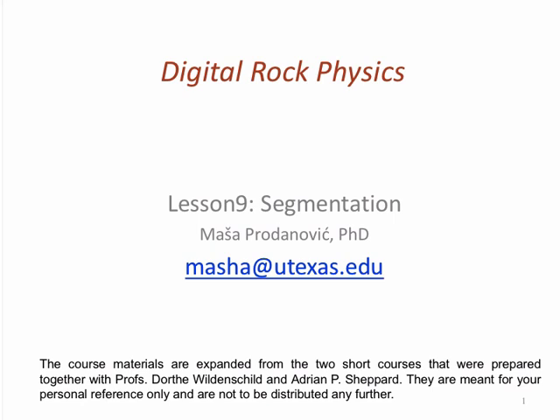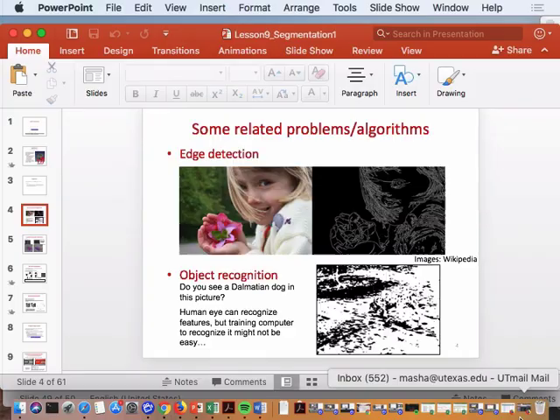Well, take this image from the PDF that I posted and play with it in ImageJ where the contrast is, because this is red, green, and blue, right? So you need to take the red, green, and blue channels and see where the contrast is. Yeah. I guess that makes sense. What? What's your question?